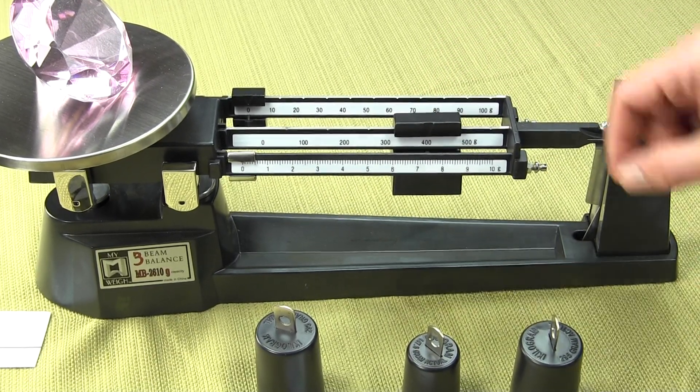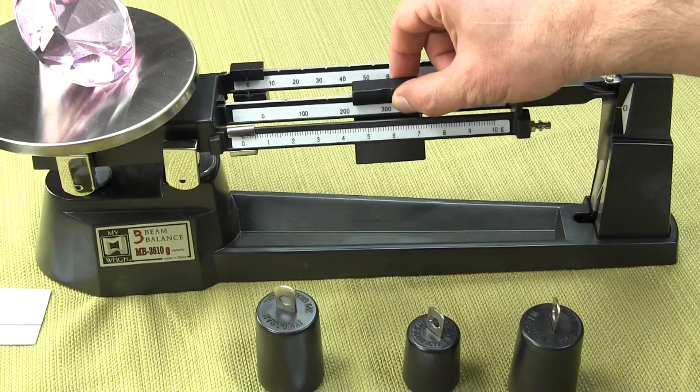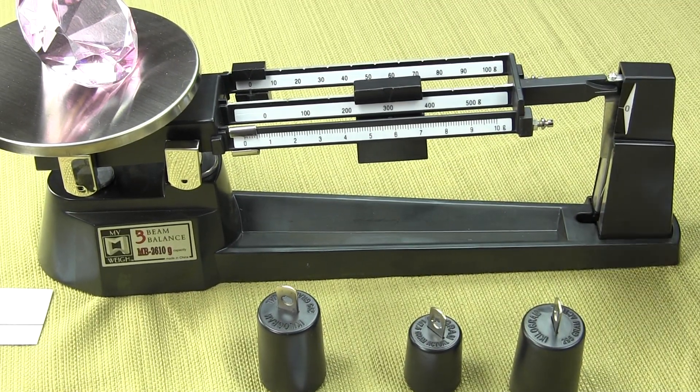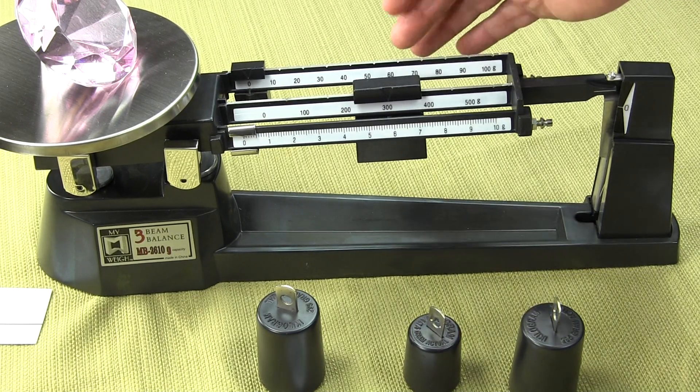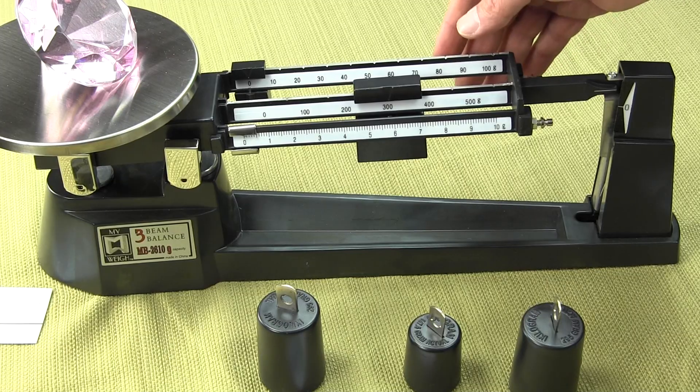We want to slide it back one and it's still too heavy. Slide it back to the 300 gram, and now the poise or the beam is up in the air. So we know that this is greater than 300 grams but less than 400.